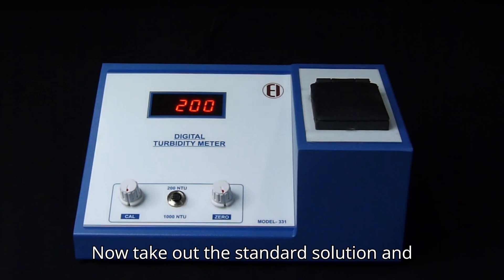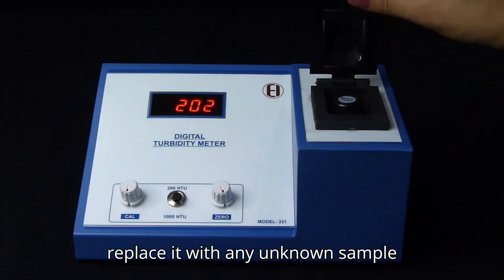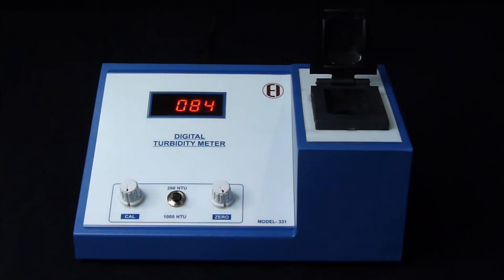Now take out the standard solution and replace it with any unknown sample solution. The instrument will provide us with its turbidity.